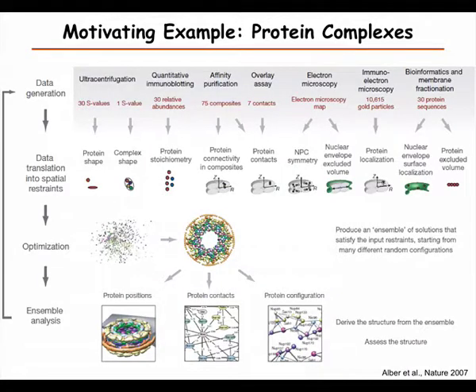Another example, of course, is to look at protein complexes. This is work by a group of people mainly from Rockefeller, with other collaborators, that looked at the nuclear pore complex and how it was assembled, and took lots of different kinds of information.